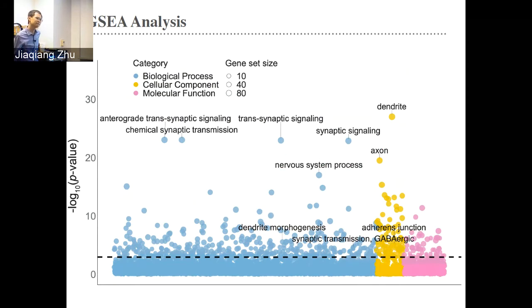Yes. If you construct 10 basis functions, but they are not orthogonal, it is complex. Yeah, but the first thing is that we don't know whether that construction will work, because no one knows the true underlying spatial location pattern. And with this combination, we summarize those p-values, and we don't know which is the most powerful or most likely one. So what we are focusing on is trying to identify spatially expressed genes, not whether a particular gene belongs to some particular pattern.